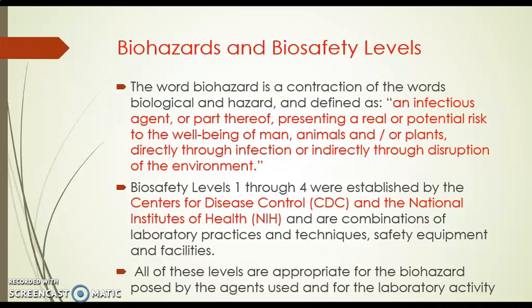Biohazards and biosafety levels. The word biohazard is a contraction of the words biological and hazard, and it is defined as an infectious agent or part thereof presenting a real or potential risk to the well-being of man, animals or plants, directly through infection or indirectly through the disruption of the environment.